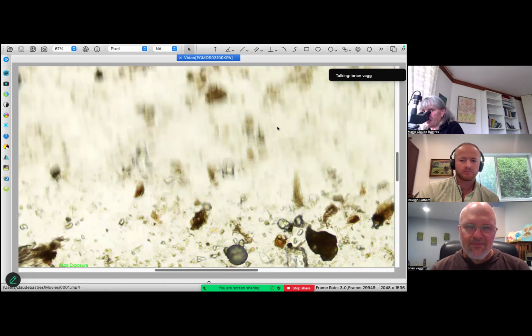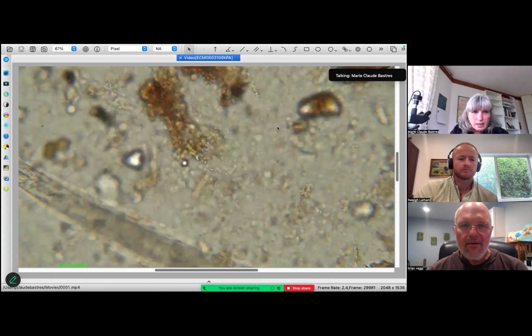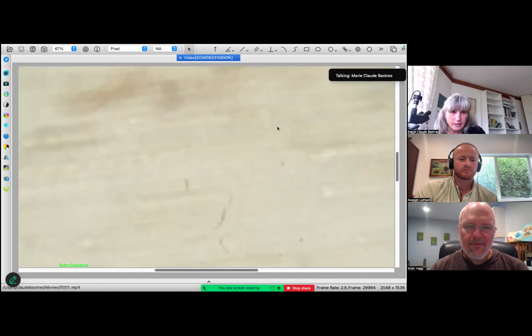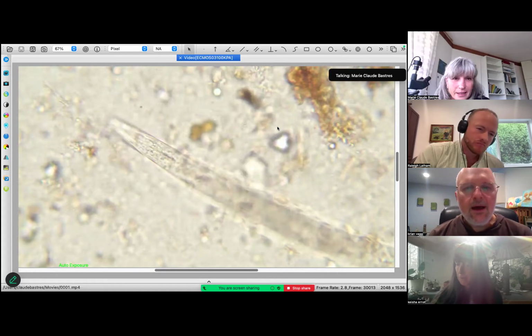Here I have a nematode. Oh, look at that. Wait a little bit to make it. Okay, so this one is not dead, just sleeping, but static. Ah, there we go.